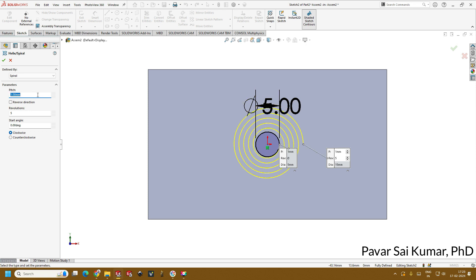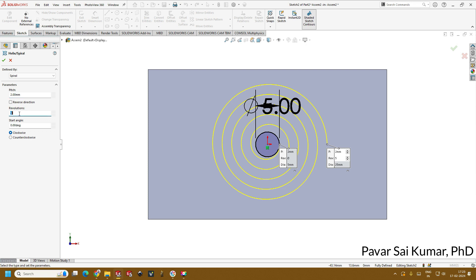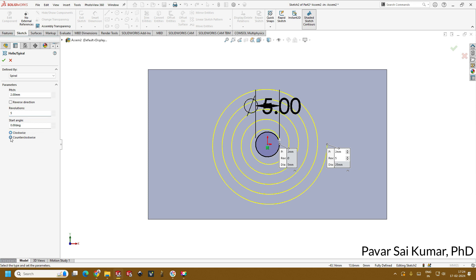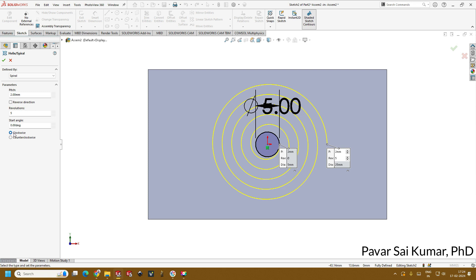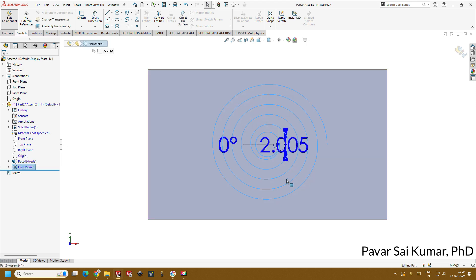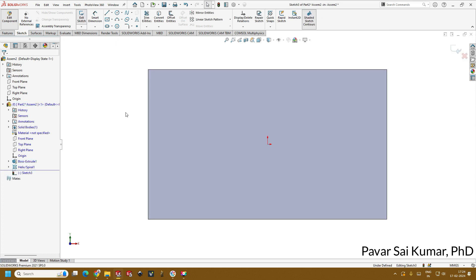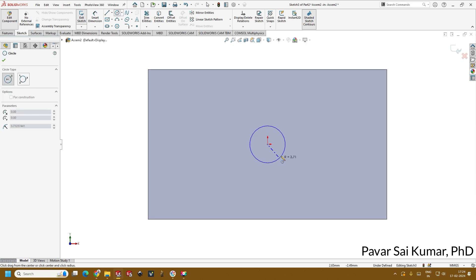For our design we keep the pitch at 2 mm, which is sufficient. You can play with the number of revolutions — 10, 5, any number. There is also a start angle, which I will explain the importance of shortly, and a clockwise/counterclockwise option. For now let's keep it clockwise and click OK. You can see the spiral highlighted in blue. Click it back, select the same face, click sketch to begin a new sketch, and create a same-sized circle again.